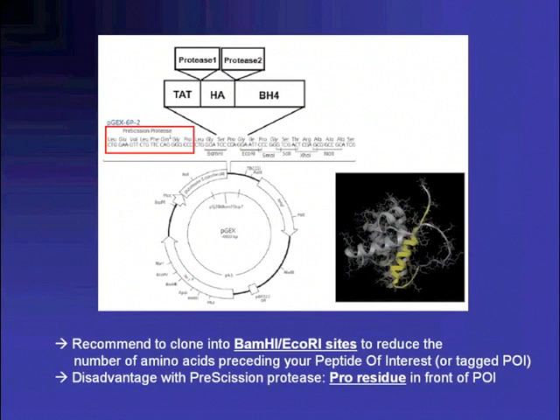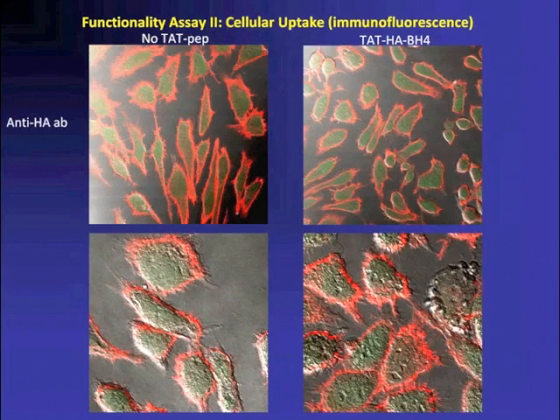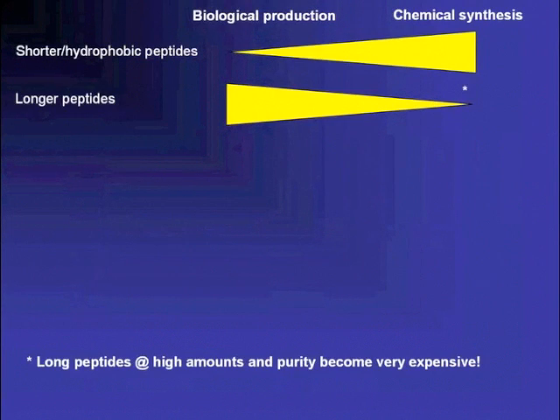Okay. When would you recommend using this method for producing peptides over chemical synthesis? You've maybe touched on it there with the length. Yeah, so for sure, if I would go for shorter and hydrophobic peptides, chemical synthesis would always be my favorite. But when we want to use it in pull-downs or other flexible methods, or we are producing longer peptides, it's really expensive to go to chemical synthesis. We have done it for one paper, and you order one peptide and that's it. Often we want to create mutants or other tags, so that's really not affordable for us.